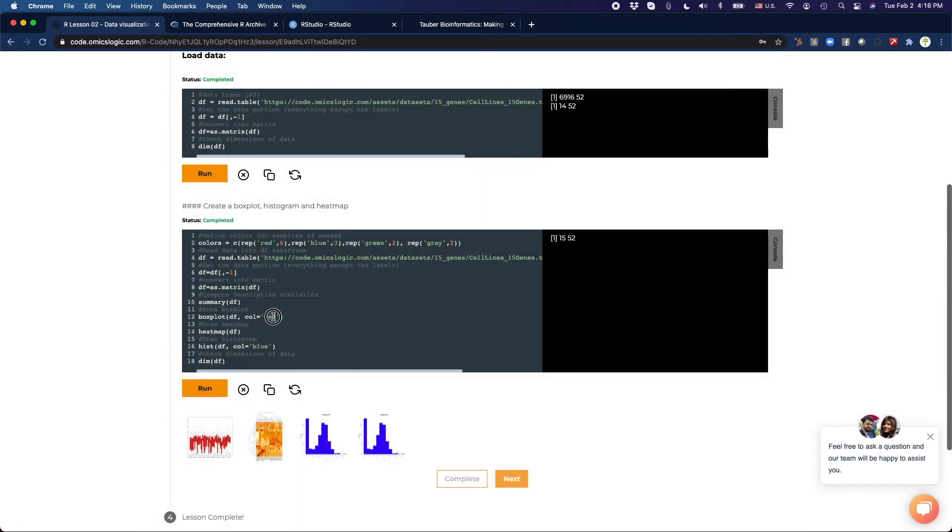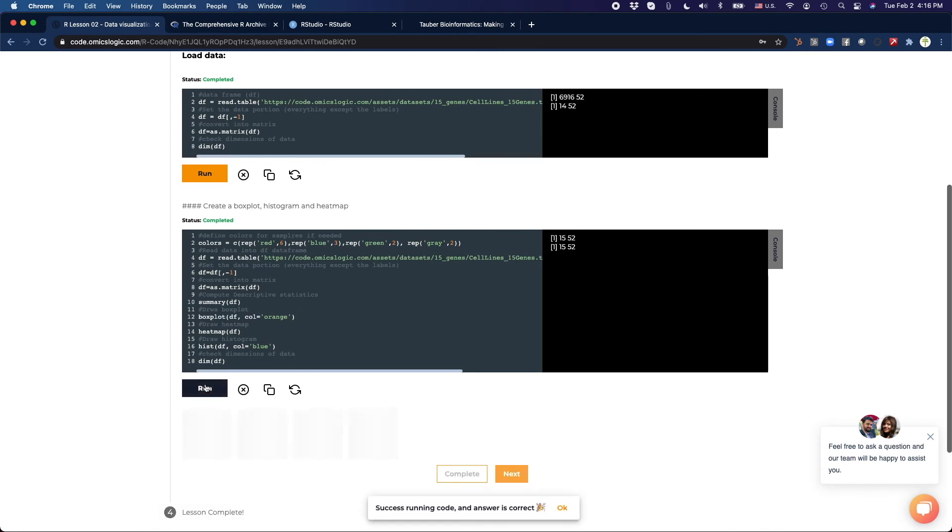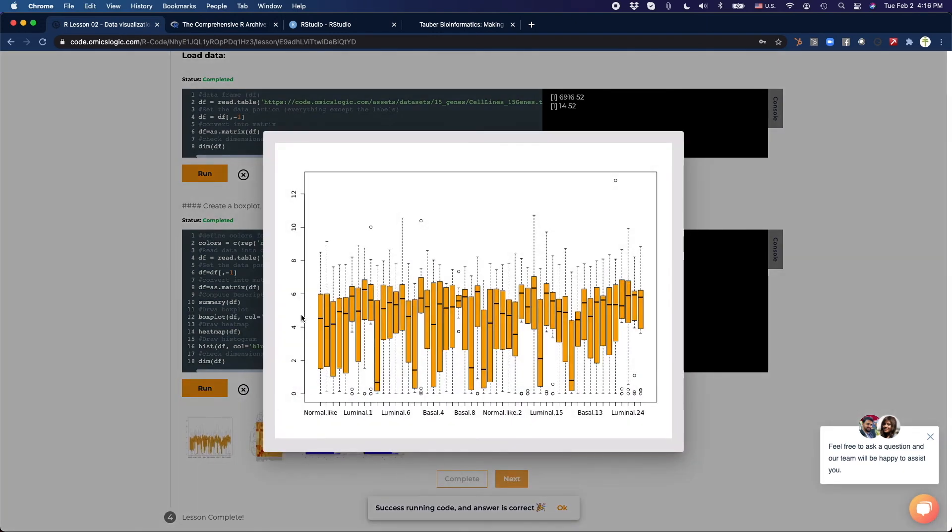Let's change something. Instead of red, let's make it orange. All right, great.